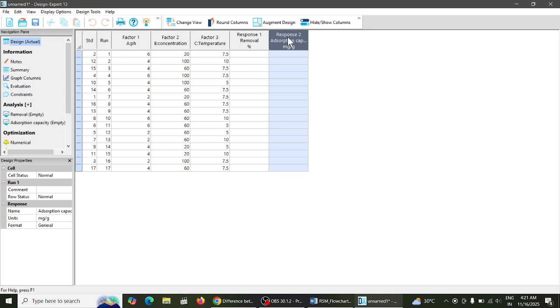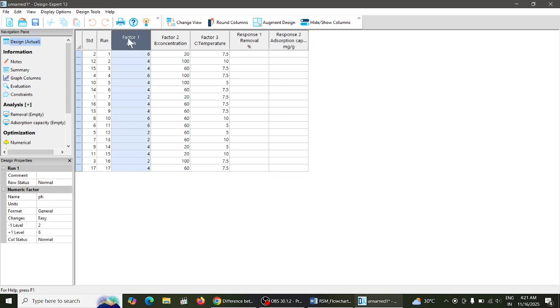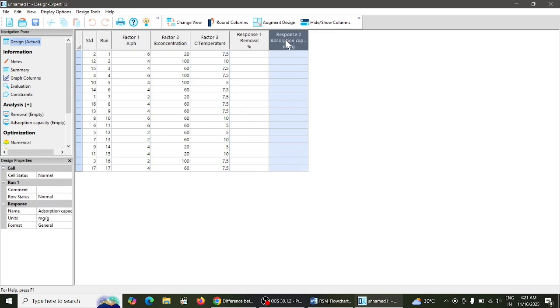Okay, so this is all about the first video. We will be restricting it to the entering of the data, and the last discussion was CCD and BBD.